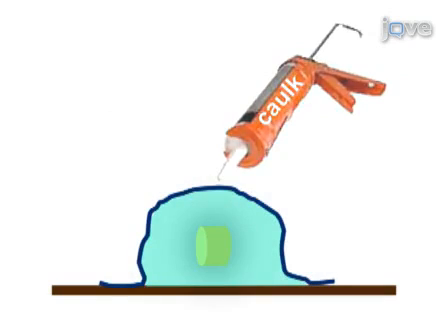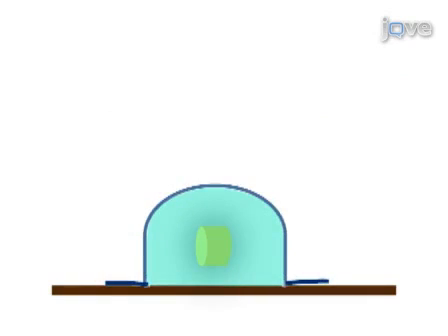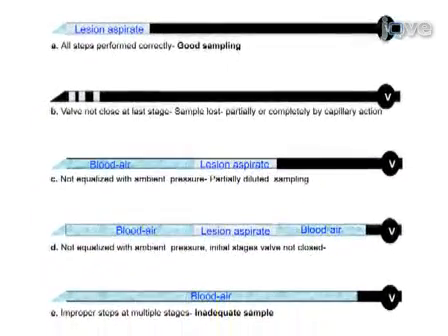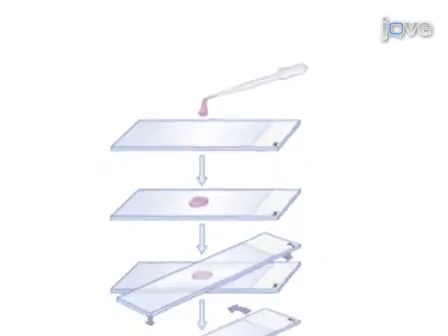Cover the core with a piece of plastic wrap and shape it into a smooth mound. Let the caulk mound cure in a warm place. After the caulk is firm and cured, peel off the plastic wrap. Practice FNA proficiency to retrieve specimen from the banana core and practice smear preparation.